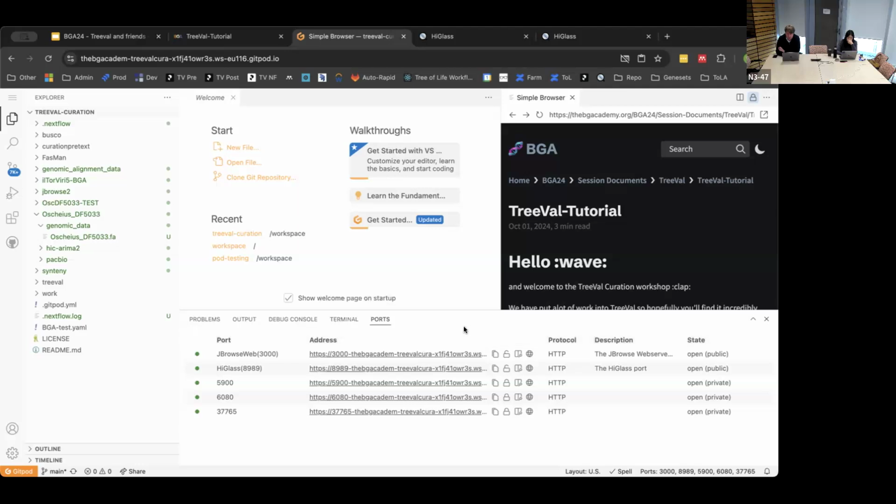Mine is completed, yours is probably still going, but for this one it's much the same. Go to HiGlass, open browser, so open HiGlass.